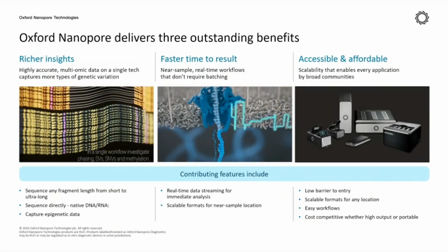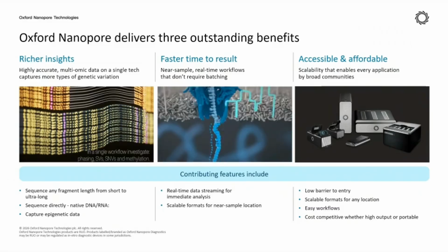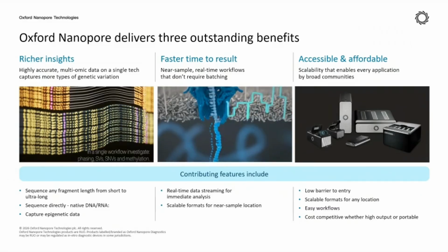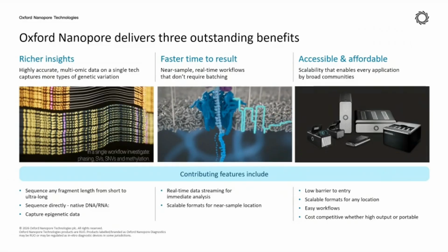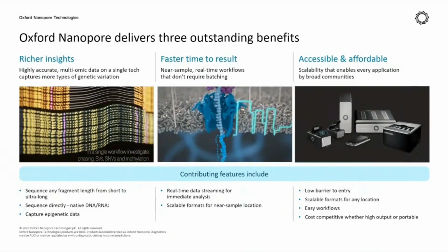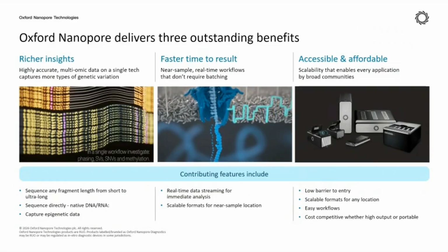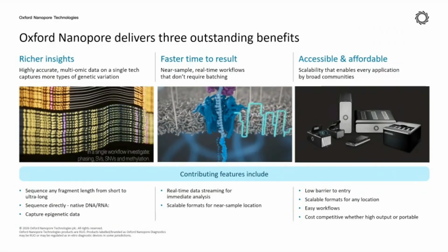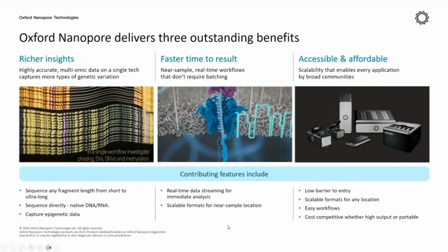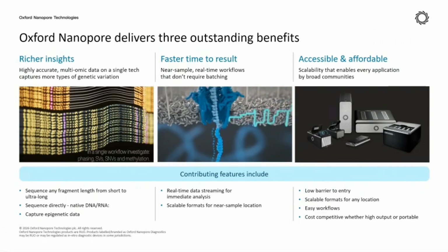And for some simple cases like sequencing bacterial genomes, when we observe that sufficient data have been obtained, we can decide to stop the sequencing, wash the flow cell, and keep the flow cell for the next use. This is important for urgent cases where we need to know the answer very quickly from the sequencing.